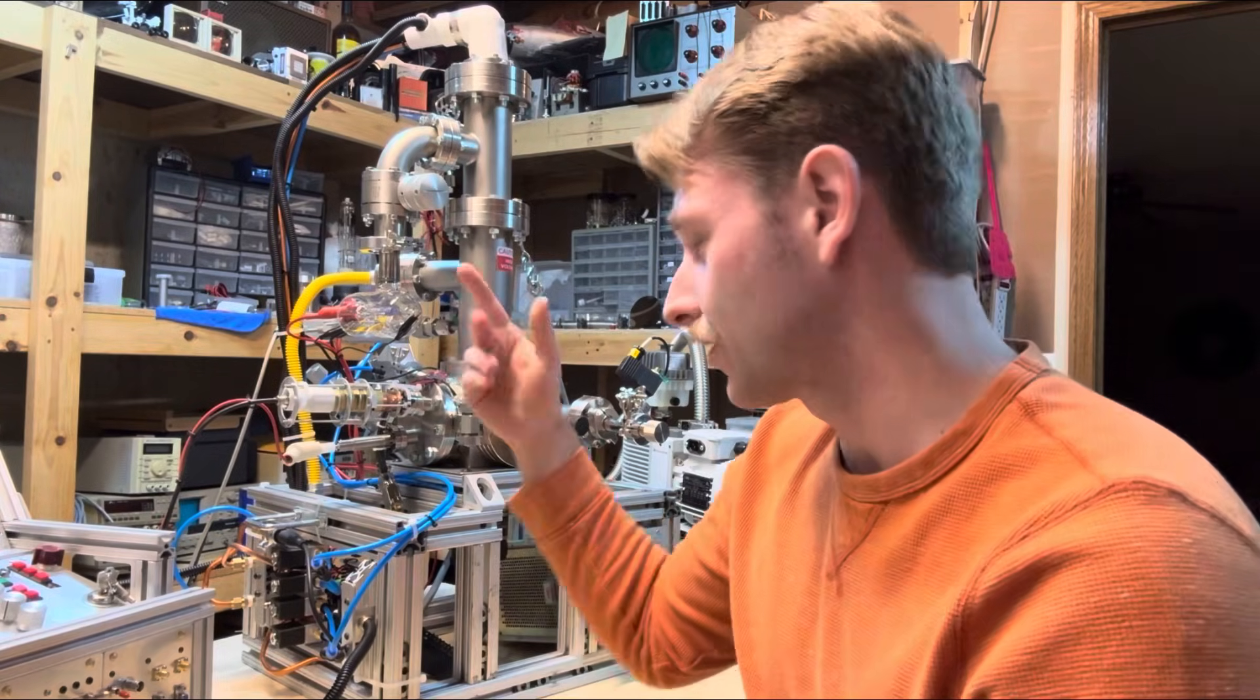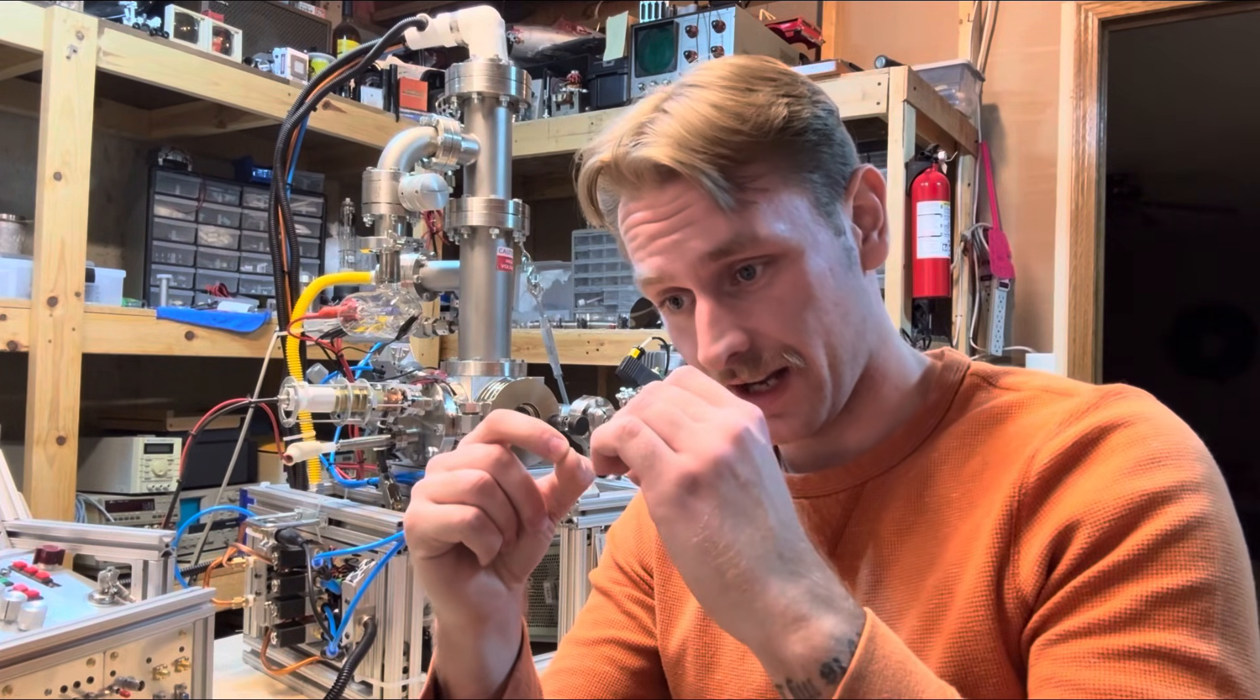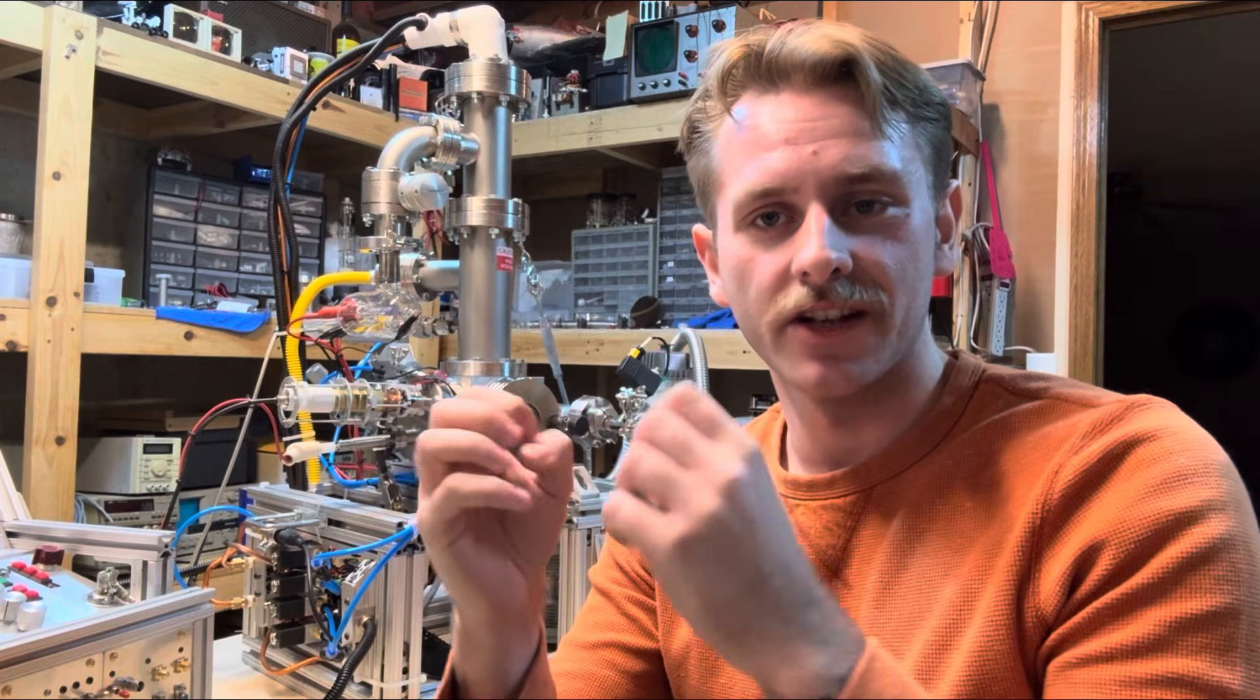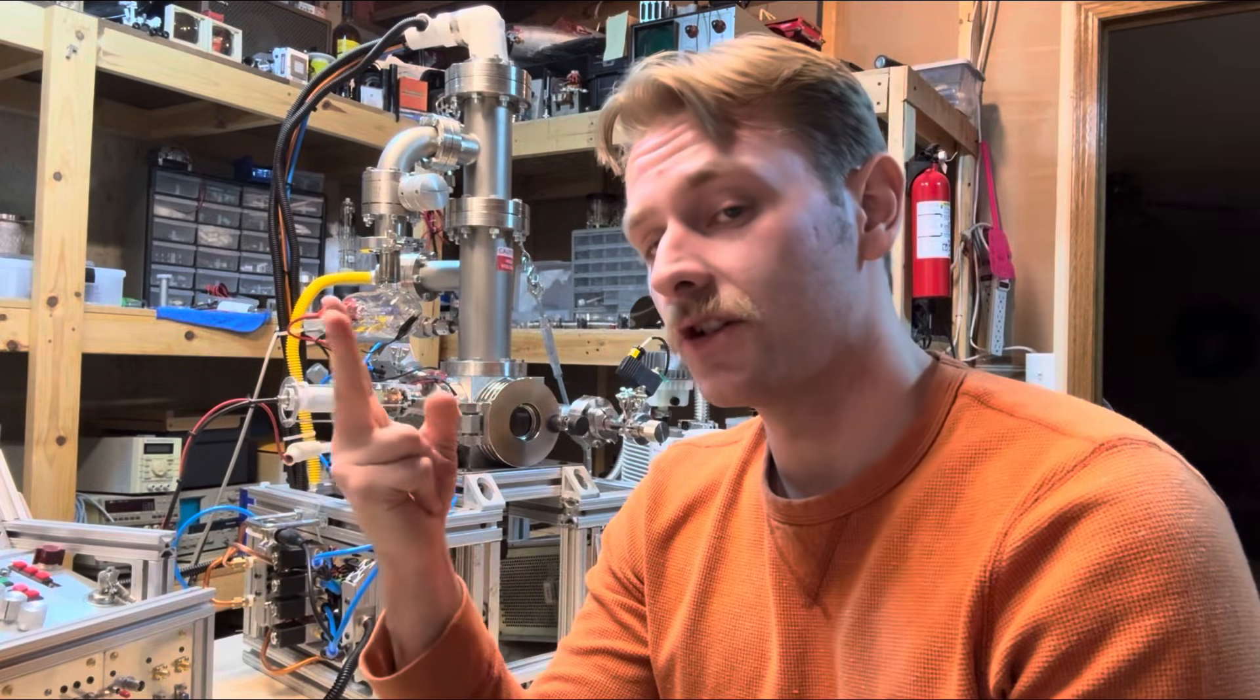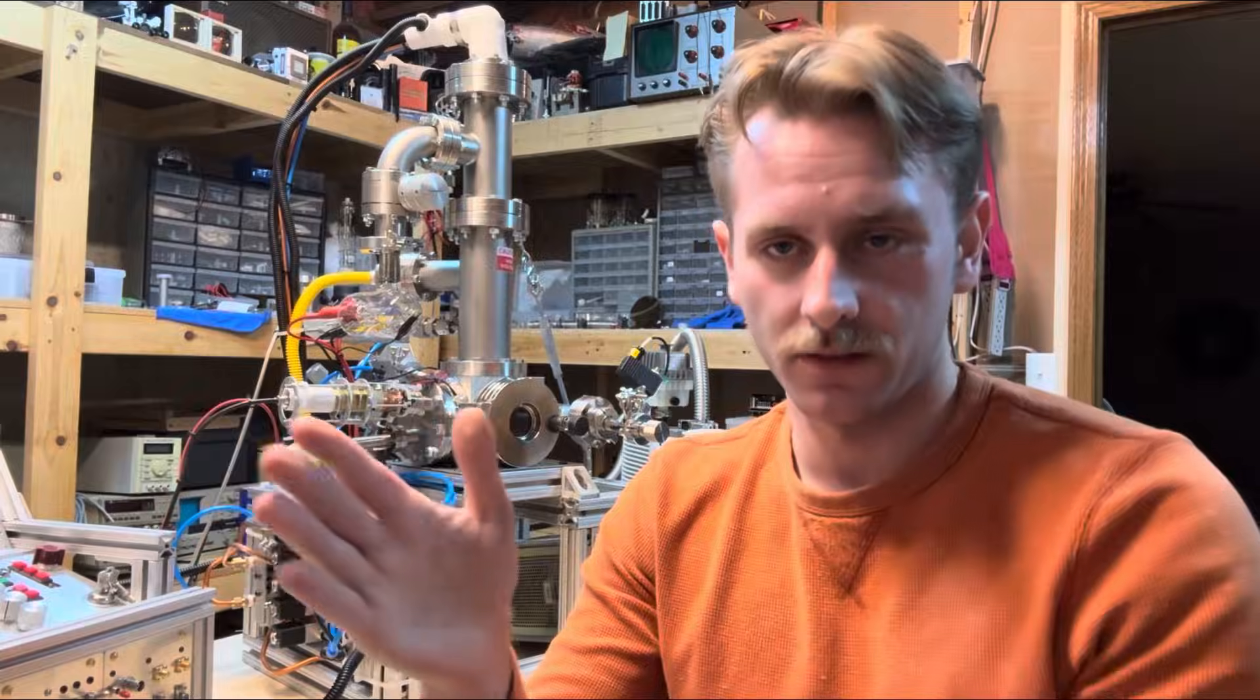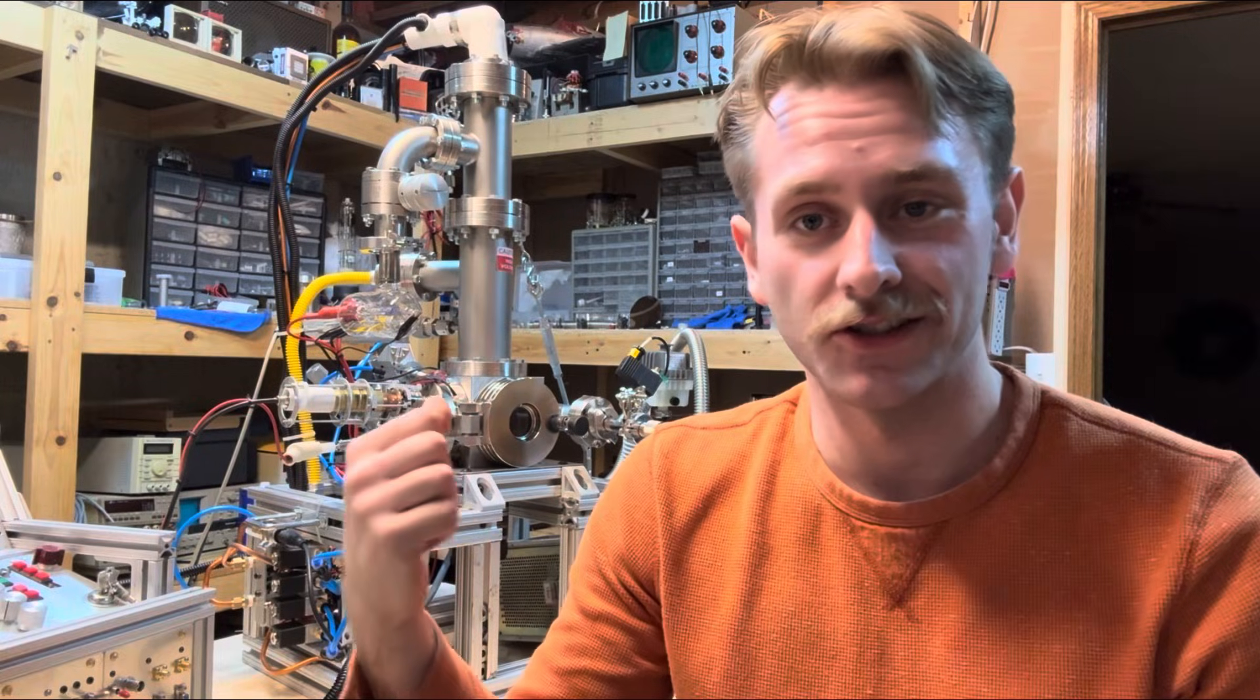Okay. So then you got your Pirani gauge, which has like a little heating element and a resistor. And depending on the resistance of that resistor, it'll tell us how much heat can conduct across the vacuum. And you'll know the pressure because of that. So you need two different gauges because that's only effective once you get to a low enough vacuum. There's just no way for the heat to get across anymore. And so then you need the nude ion gauge.